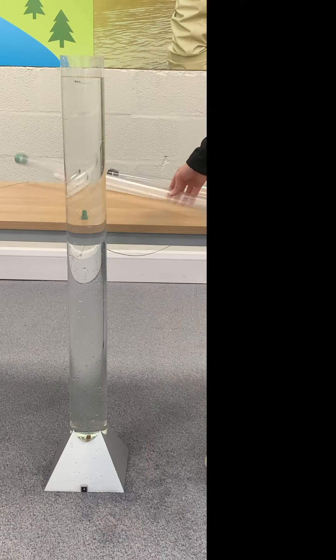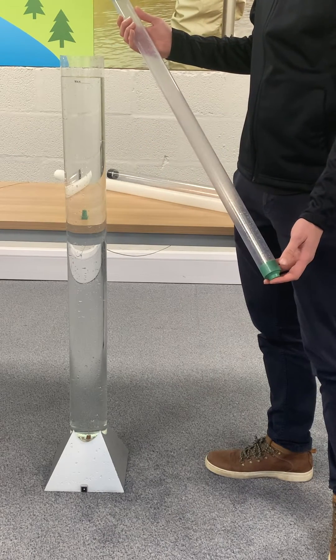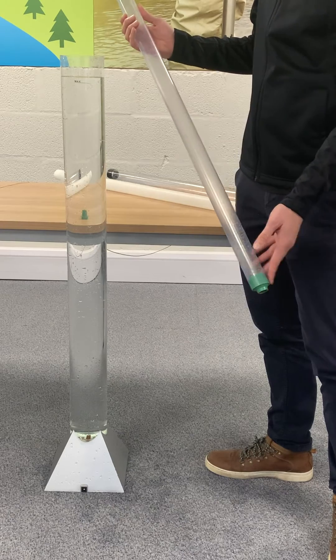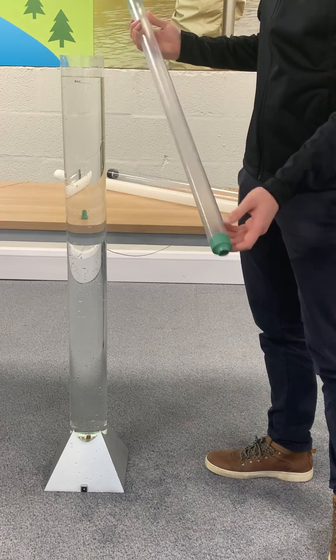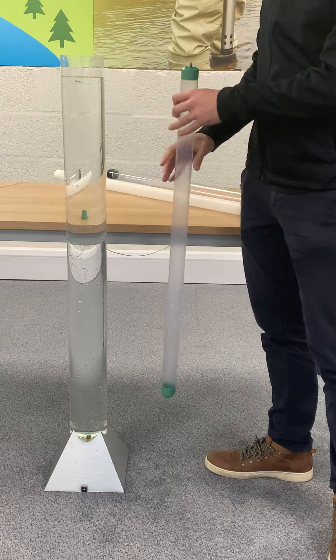Balers are one of the simplest ways of taking a sample and probably one of the first to be designed. They consist of a plastic tube which is usually around half a metre to a metre long with a ball valve on the end. The ball is denser than water and so sinks to the bottom of the tube and captures a sample when loaded into the water.